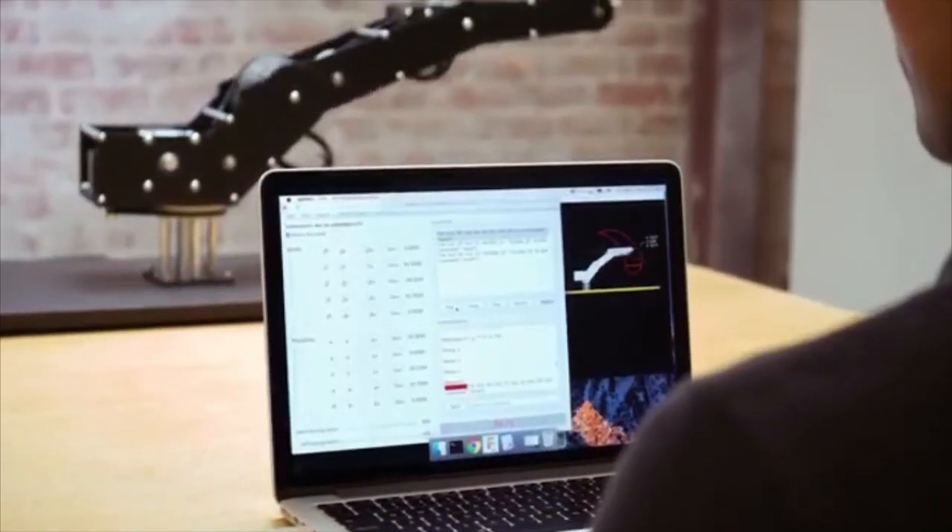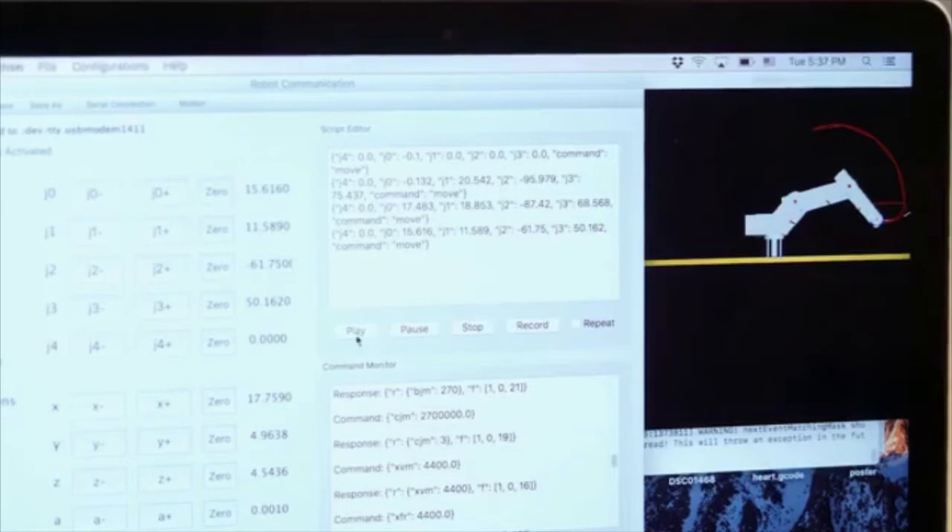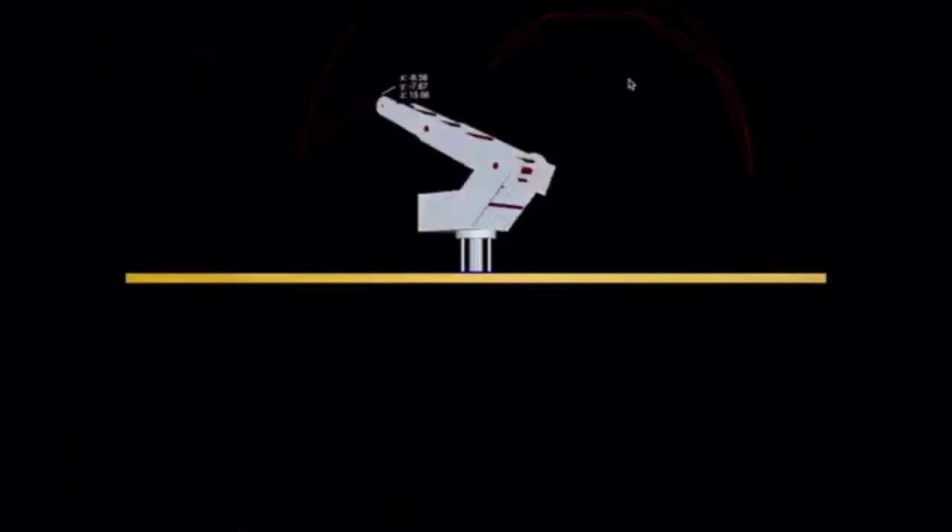Dorna Lab is a software platform for developing applications and running them on Dorna. With Dorna Lab, you can write scripts for automating your tasks and simulate your applications before executing them on Dorna.